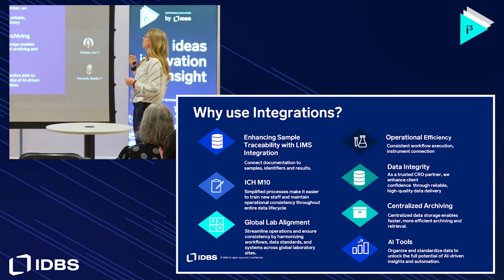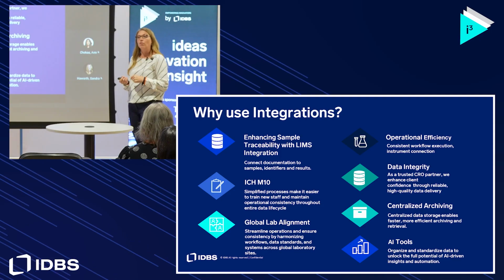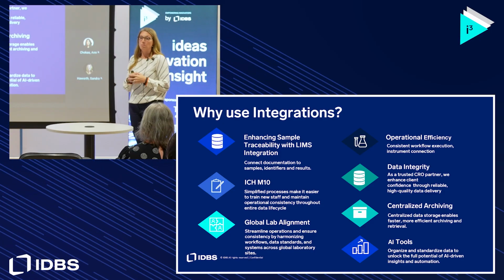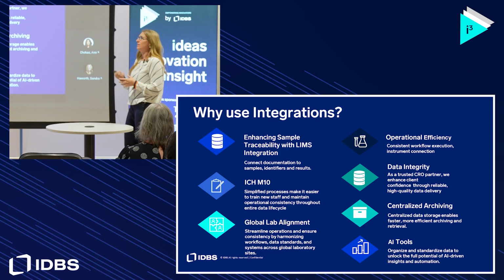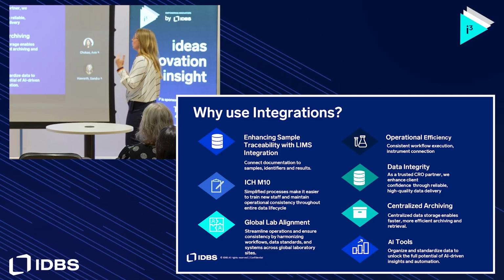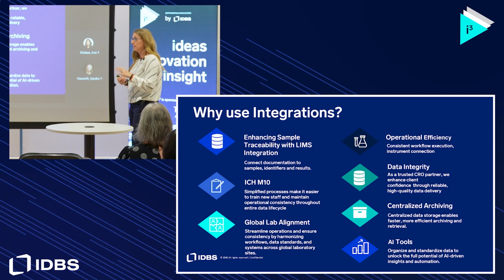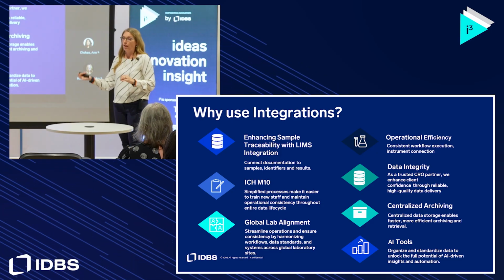Operational efficiency. So yeah, if we can click a button and pull data from Watson or click a print button on the balance and that data goes straight into the spreadsheet, that just helps them be more efficient as they're collecting their data in the lab. We've been talking about data integrity all day, but essentially if we get everybody to use all of the templates, and we know the data going into their experiments is higher quality, then for our customers, the data coming out will be of higher quality.